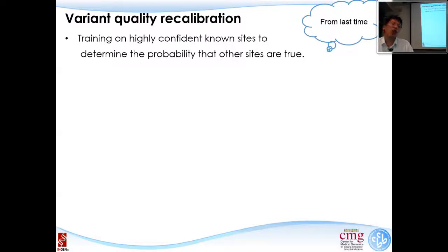strand bias to be not significant. So there are many different descriptors on these particular variant locations. If you really want to filter out and throw away the bad variants, the miscalls, in that case you probably will put a lot of thresholds there. You say, okay, I want the sequencing depth to be larger than 20, so you have one parameter. You want the average mapping quality to be larger than 20. There's another threshold. So you can set up a dozen of those thresholds.